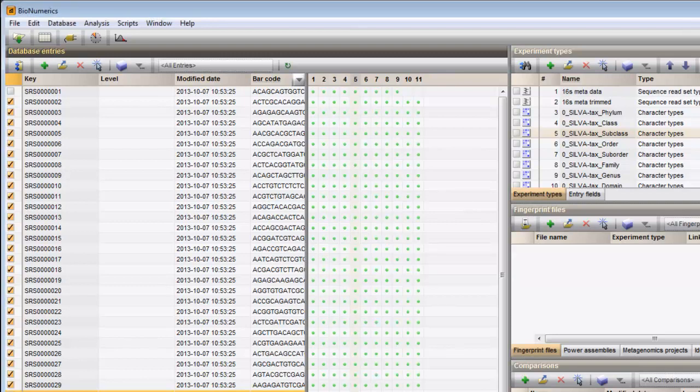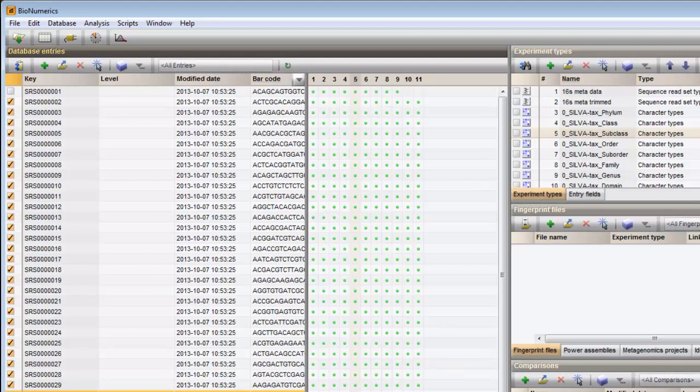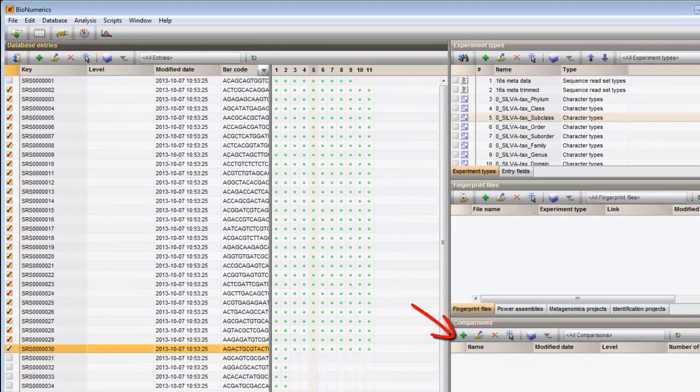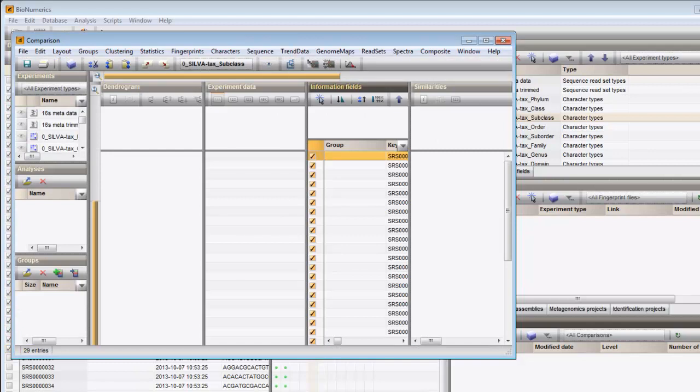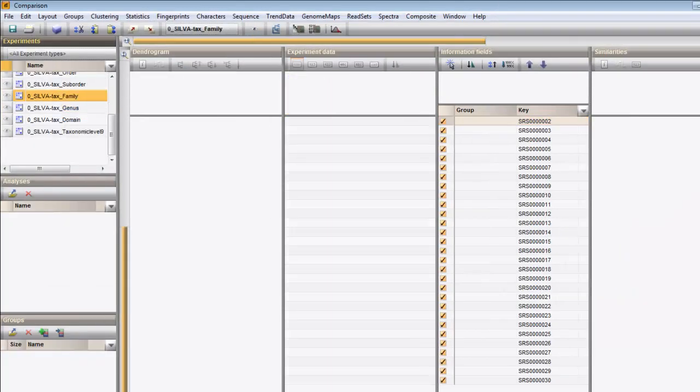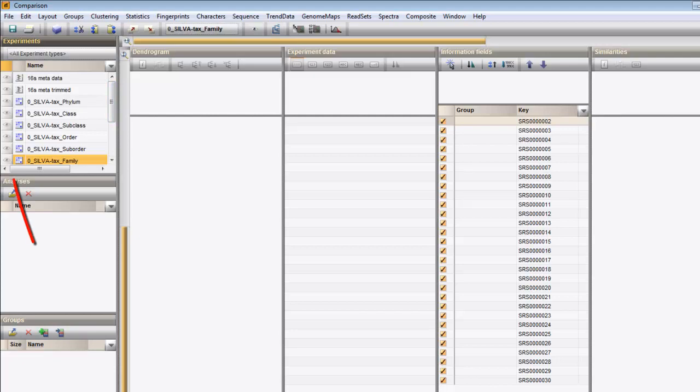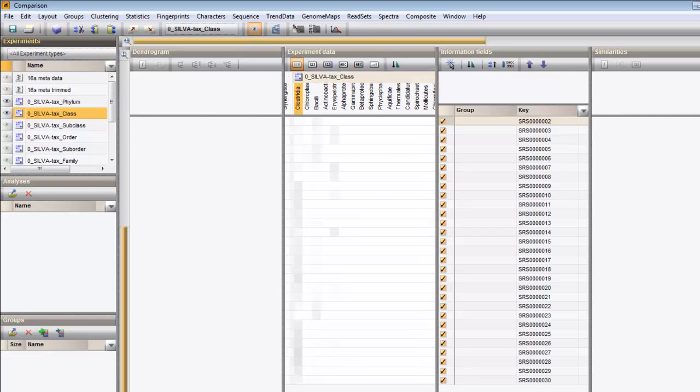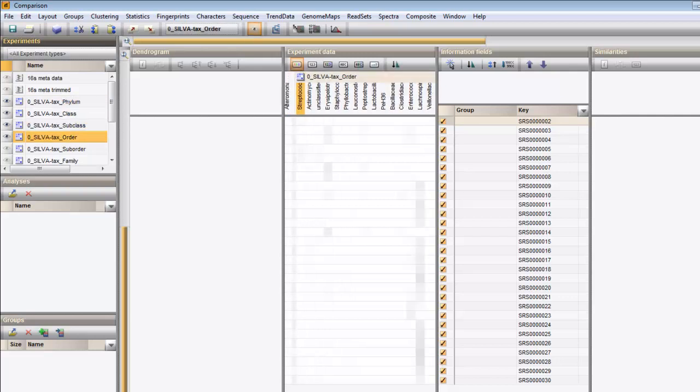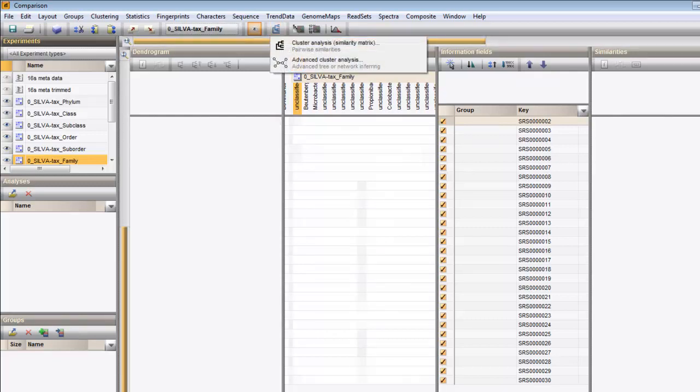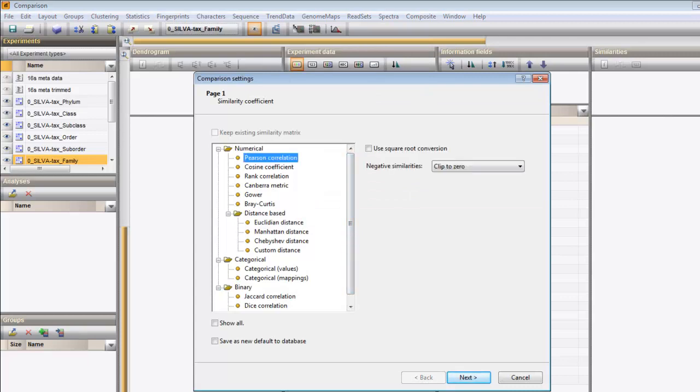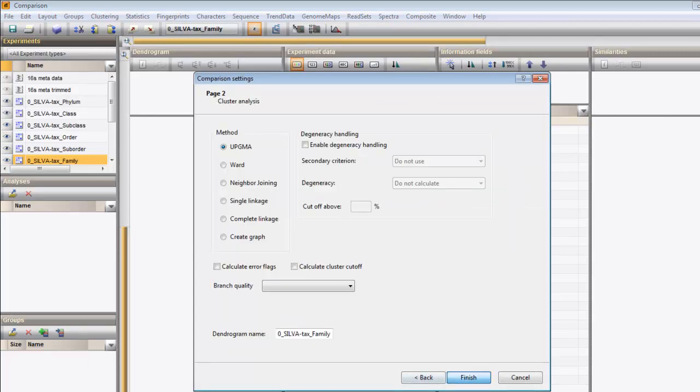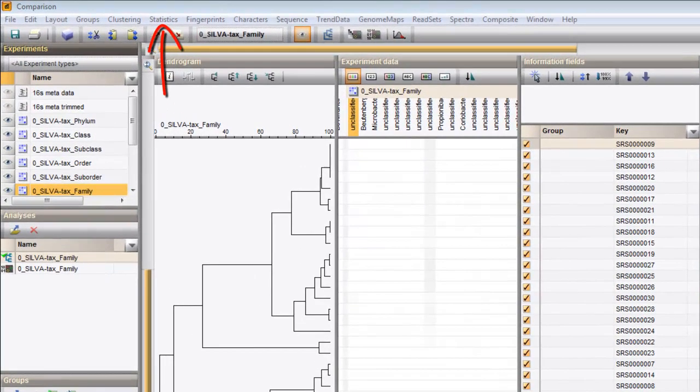Once the batch analysis is completely calculated, all OTU abundances are present as character data and can be used for further analysis in, for example, the comparison window. The data can be visualized, used for clustering, or further used for PCA analysis, MANOVA analysis or other statistical analysis.